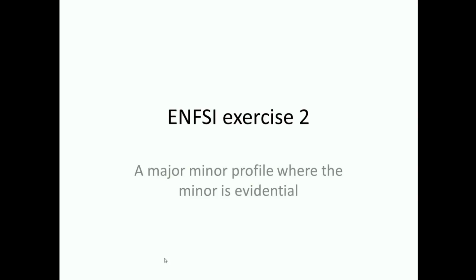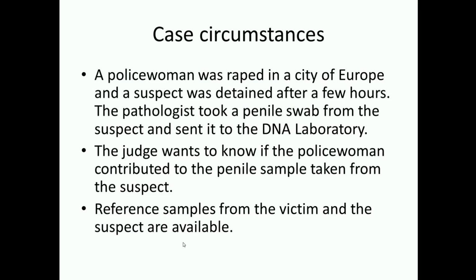I'm going to run through ENFSI exercise 2 again. This is a major minor profile where the minor contributor is evidential. The case circumstances are as follows.